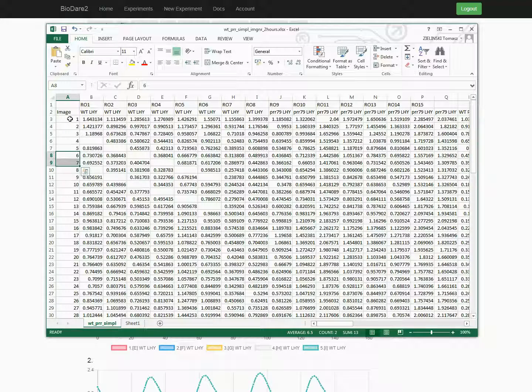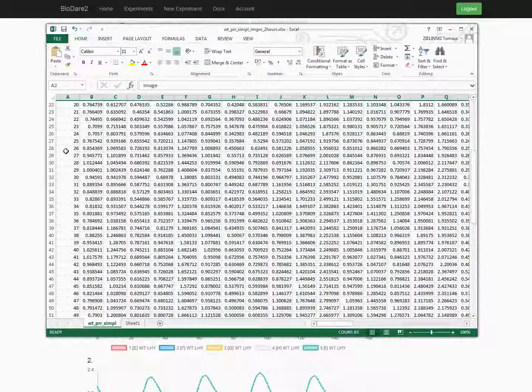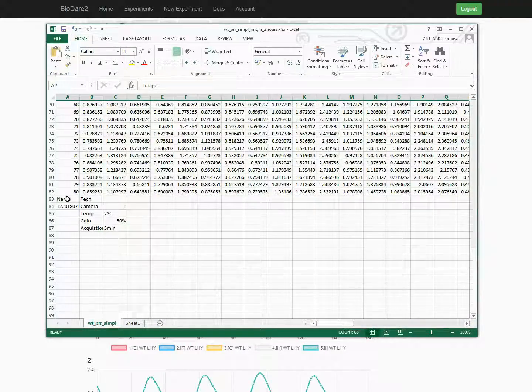Another problem is caused by non-numerical content. It typically happens if you enter the wrong row number as a starting point when defining time column properties. Or the equipment may be printing some metadata at the end of the file, so check for it.